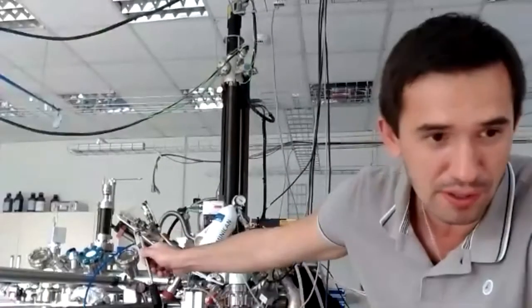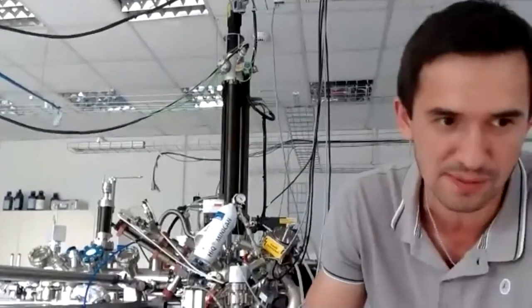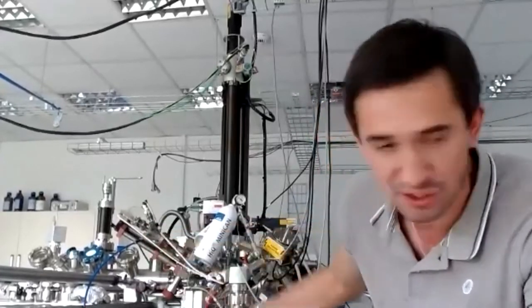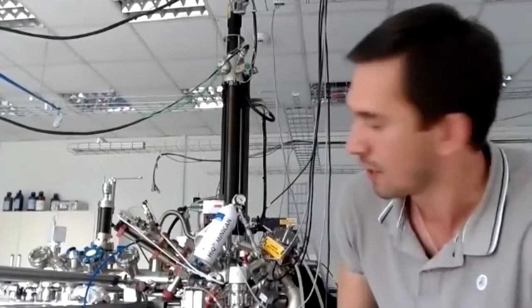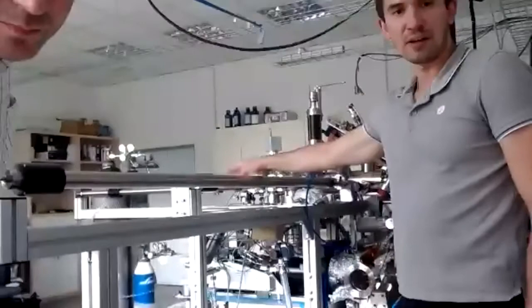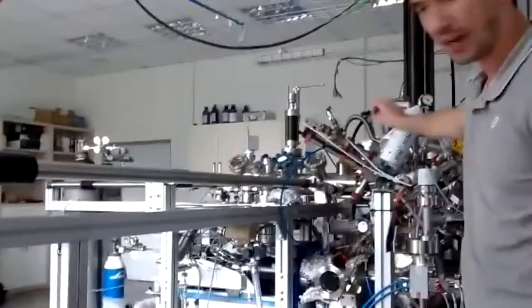You take this sample, you load it to the fast entrance chamber. I did it before this session. I just want to explain how it usually starts. You mount the sample and load it to the fast entrance chamber, which should first be vented. Then you evacuate it and wait 10 minutes until the vacuum is relatively good. Then you can open some valves and, using several transfers like this one, and there is another one, it's maybe not seen so well, you transfer the sample first to the preparation chamber.